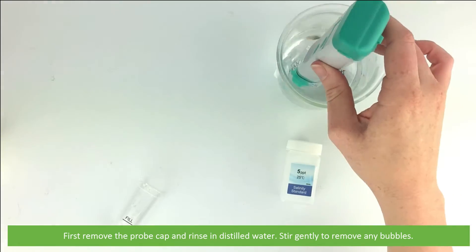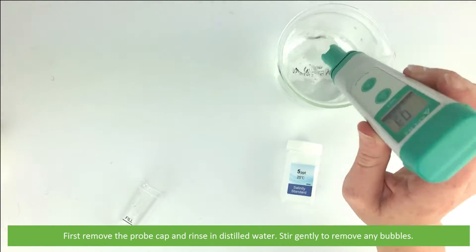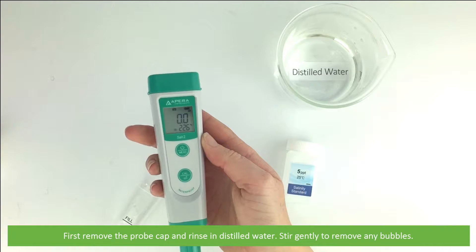First remove the probe cap and rinse in distilled water. Stir gently to remove any bubbles.